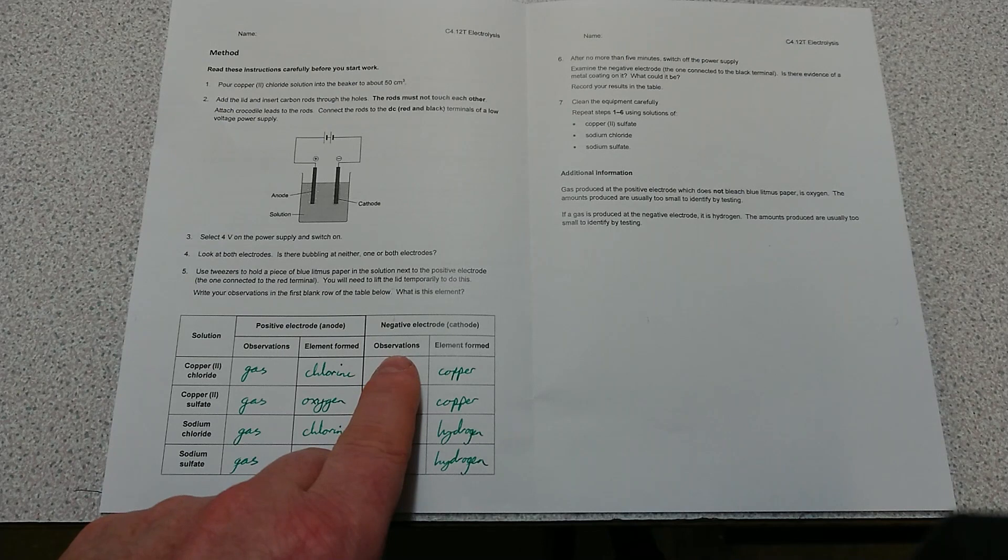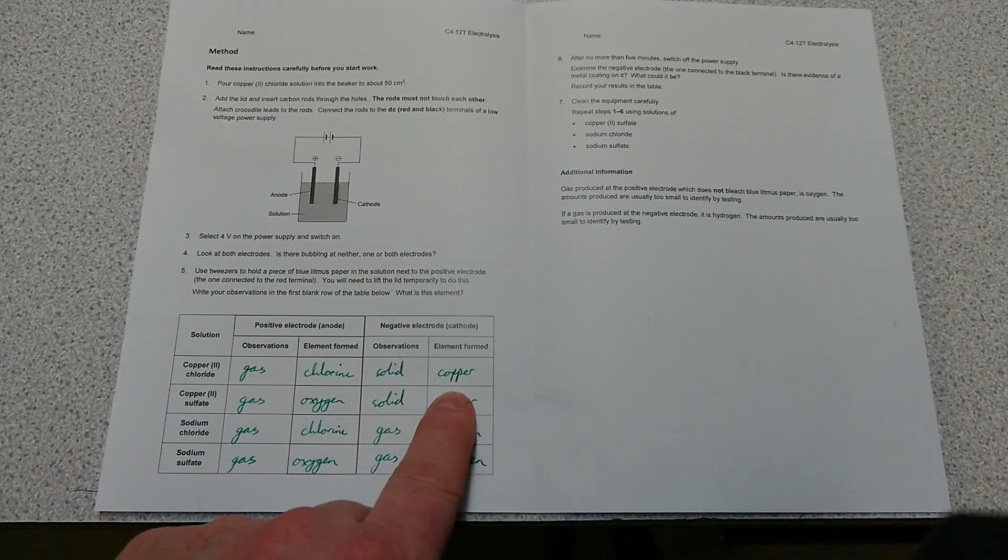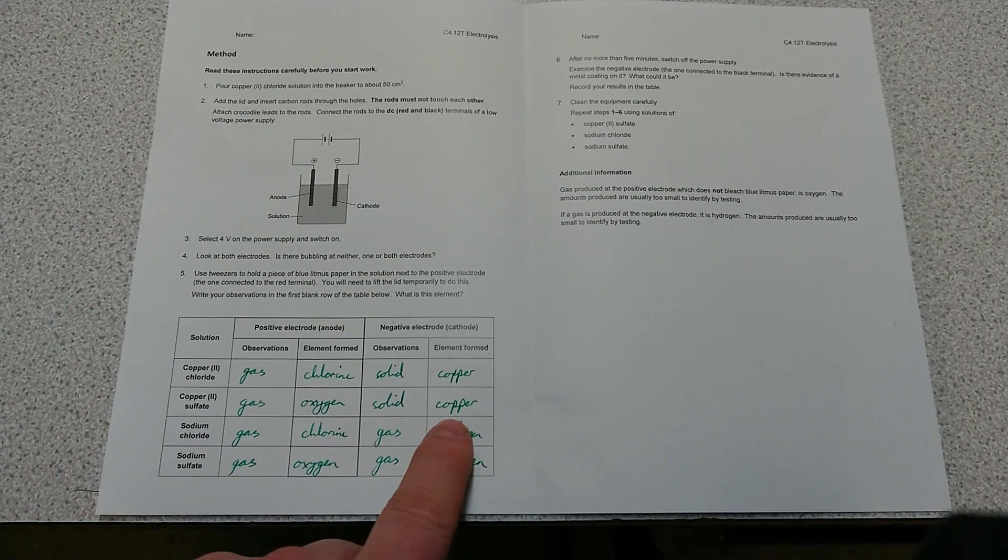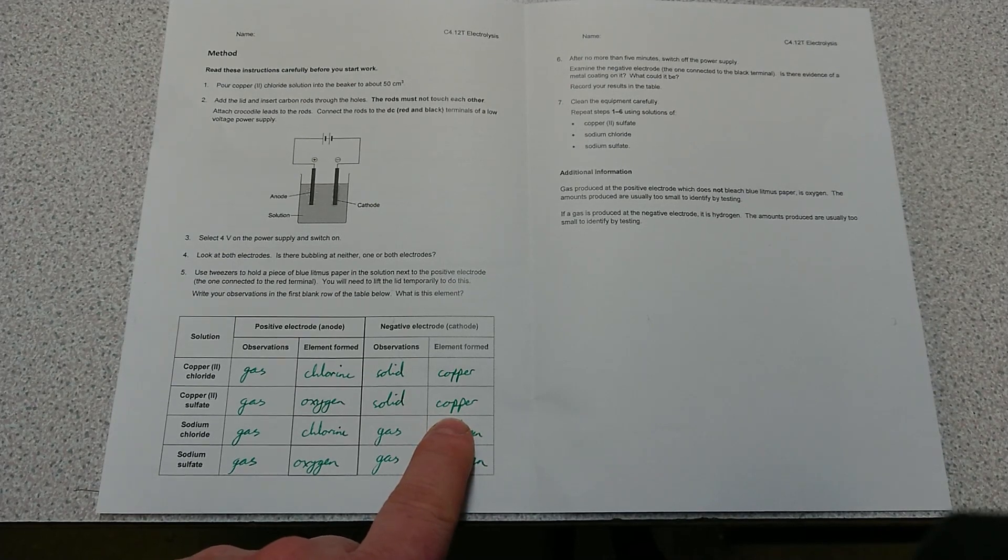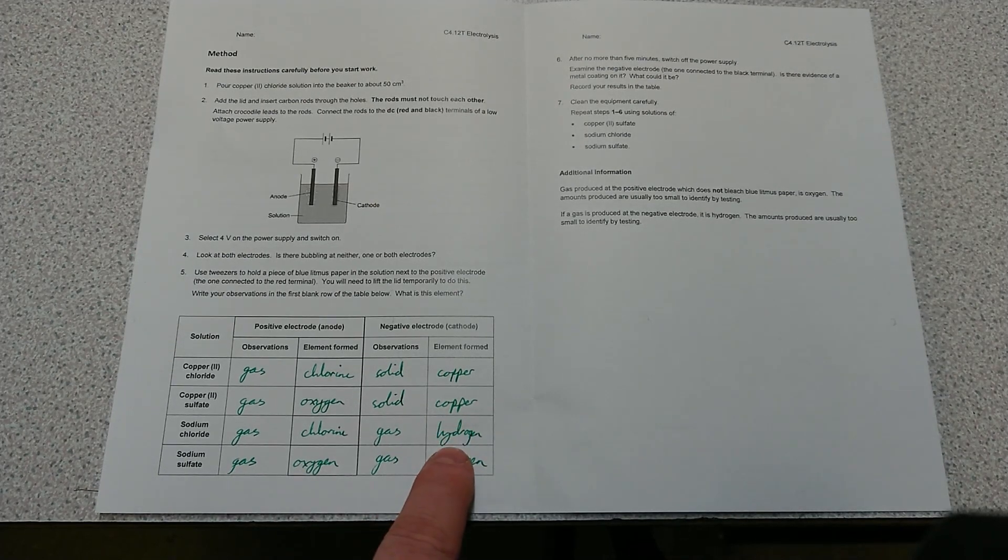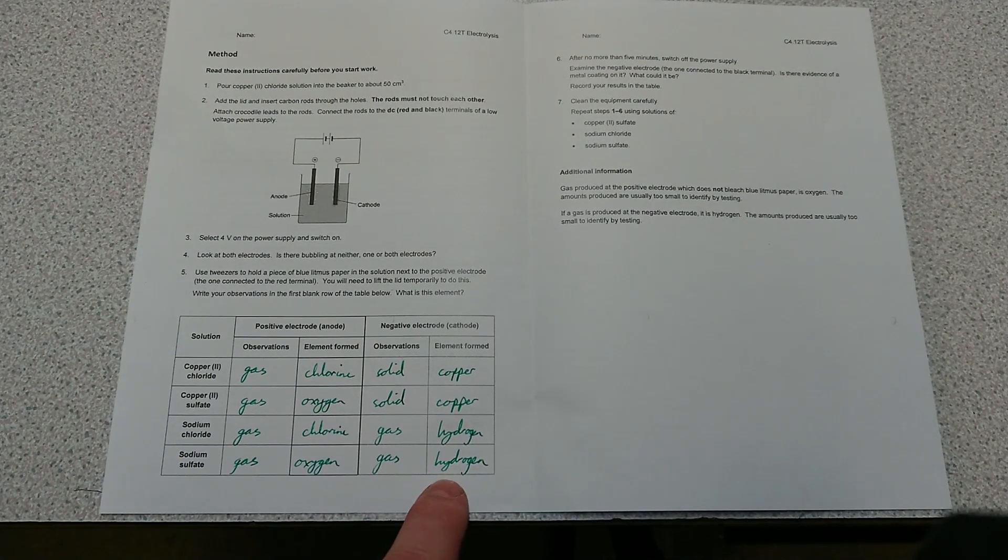On the cathode, we got copper from copper chloride, copper from copper sulfate, and then for the sodium chloride and sodium sulfate we got hydrogen.